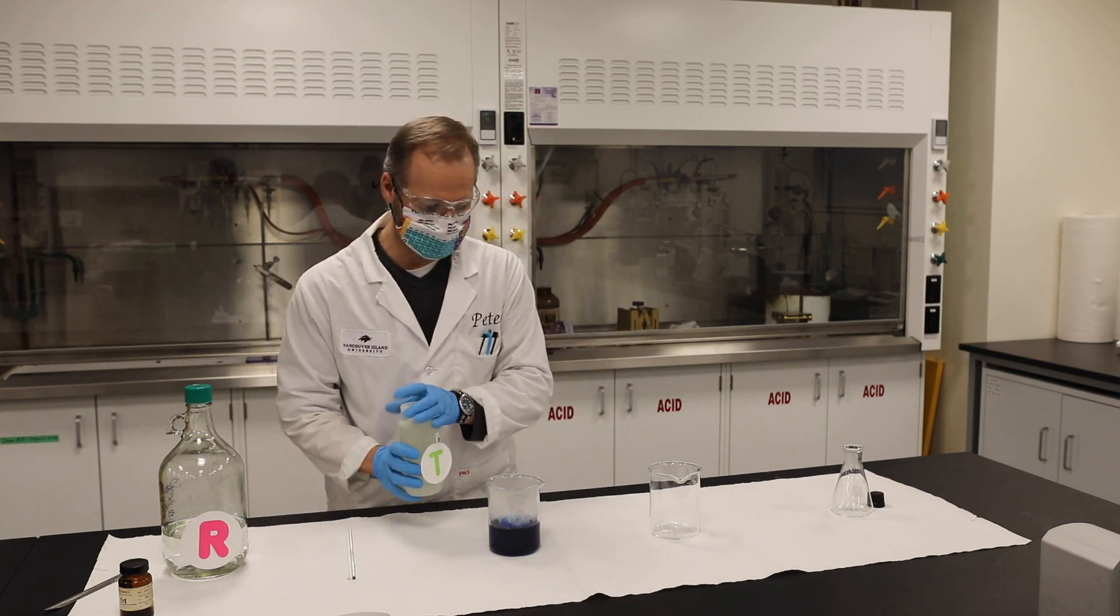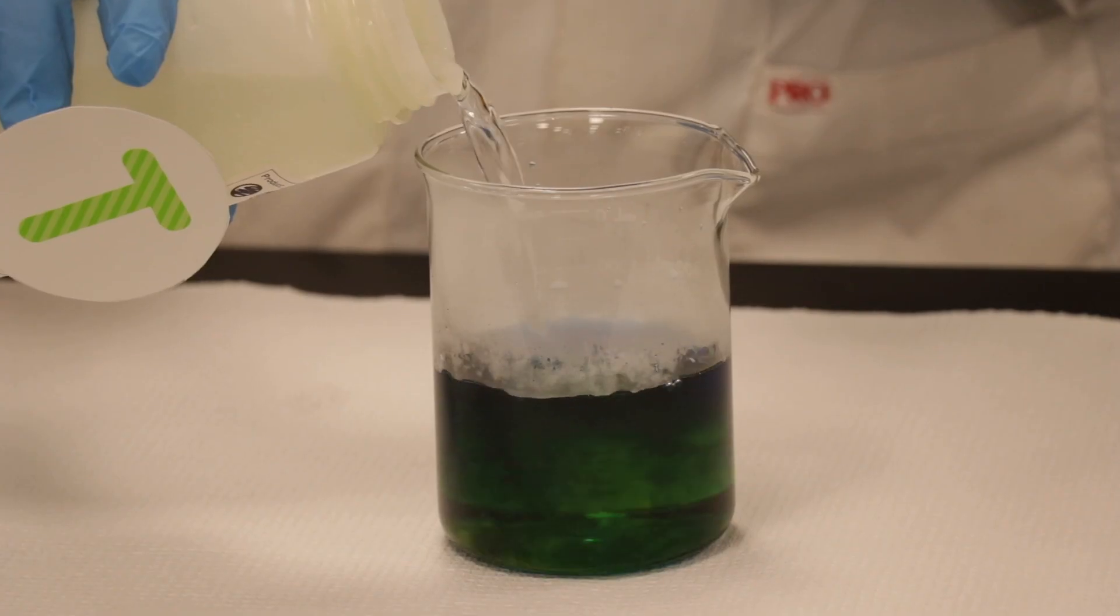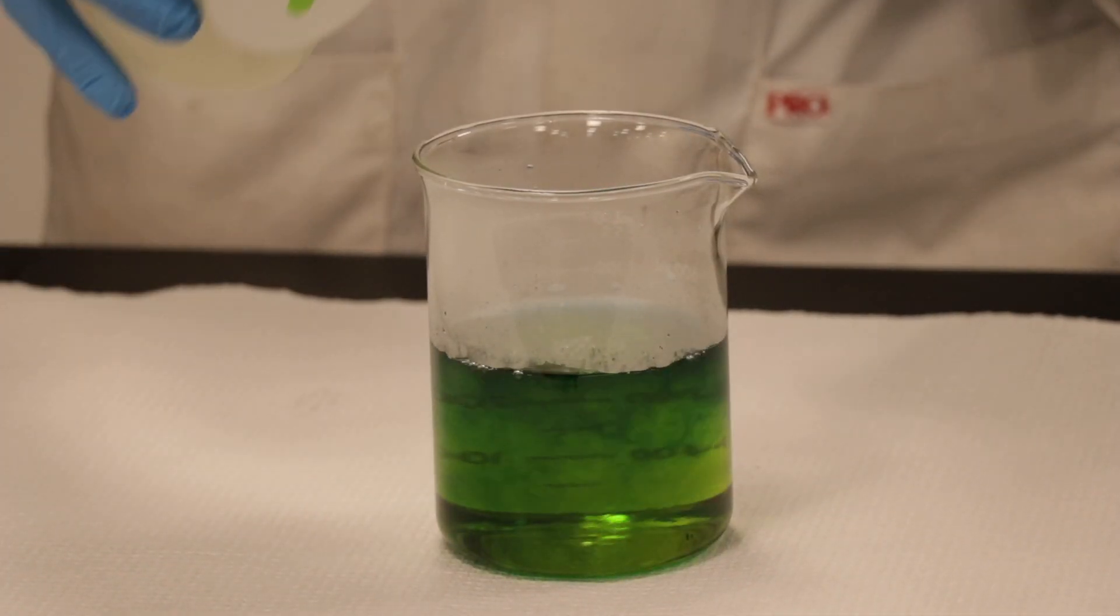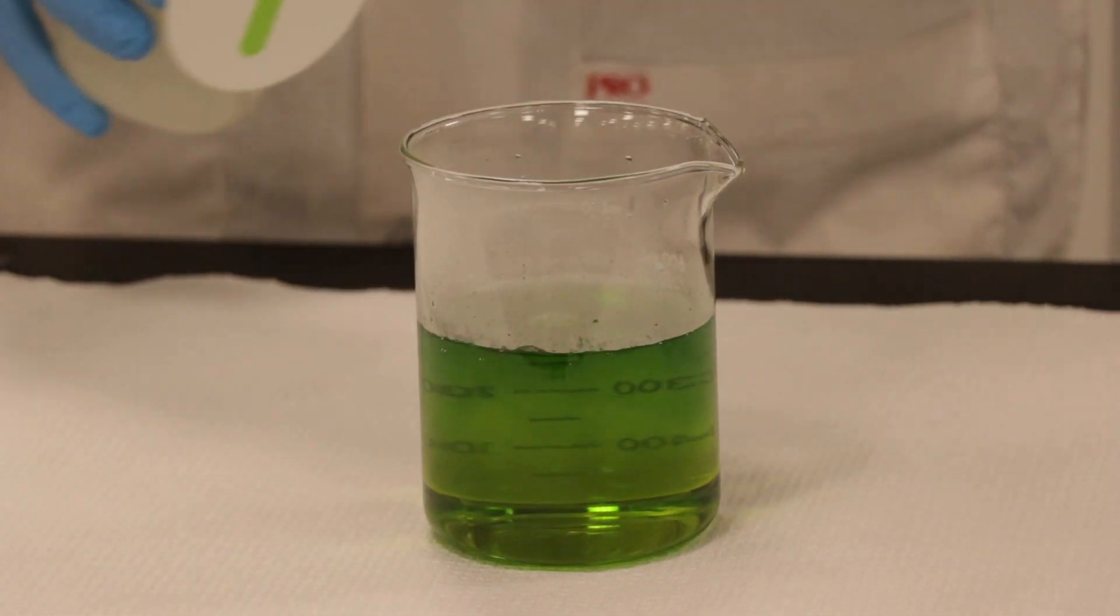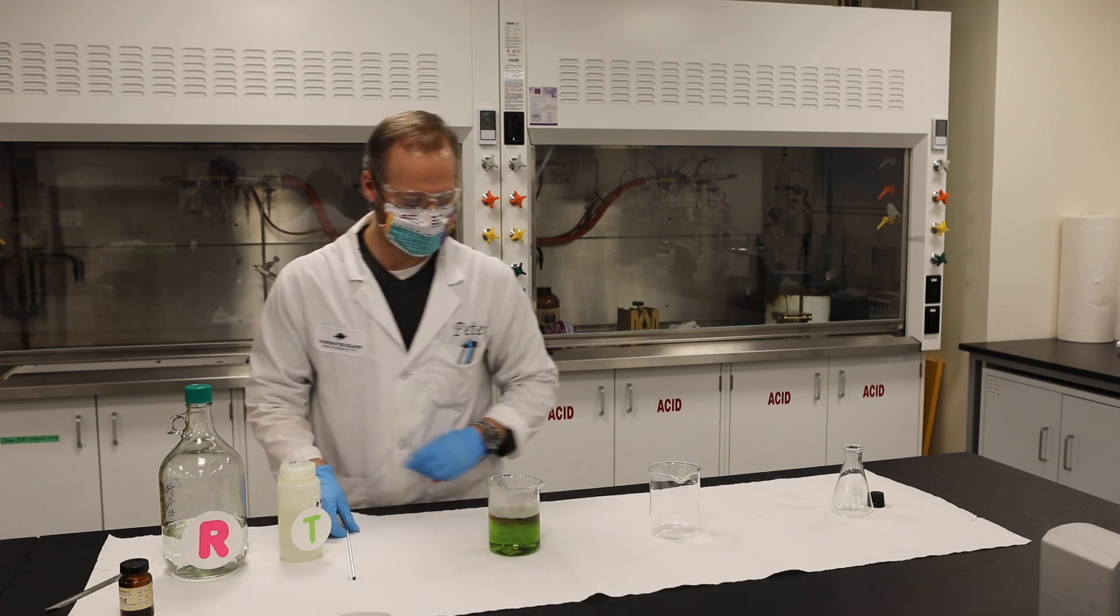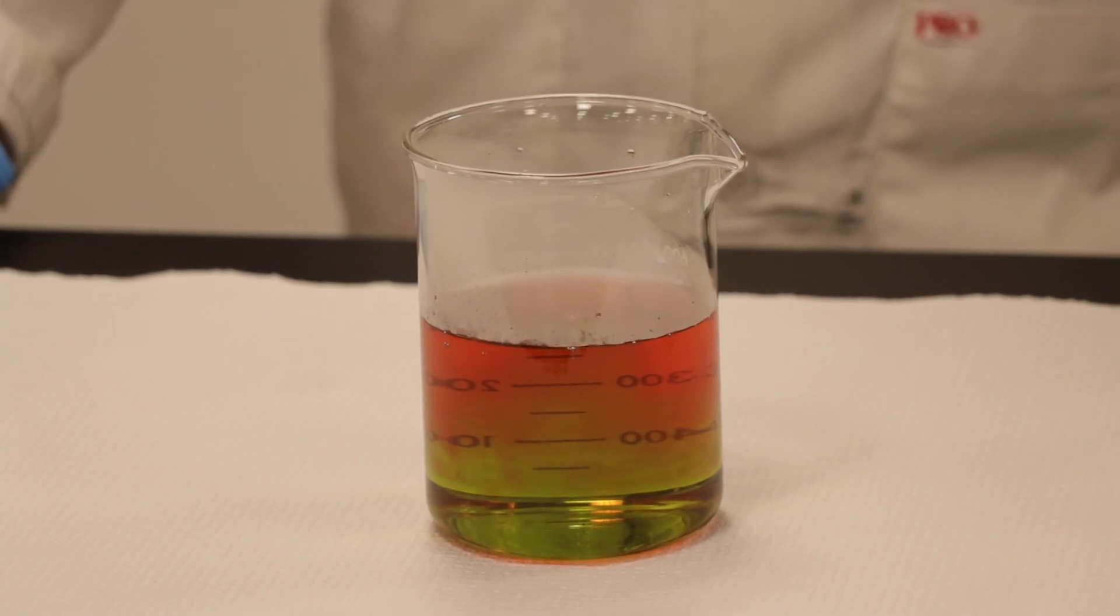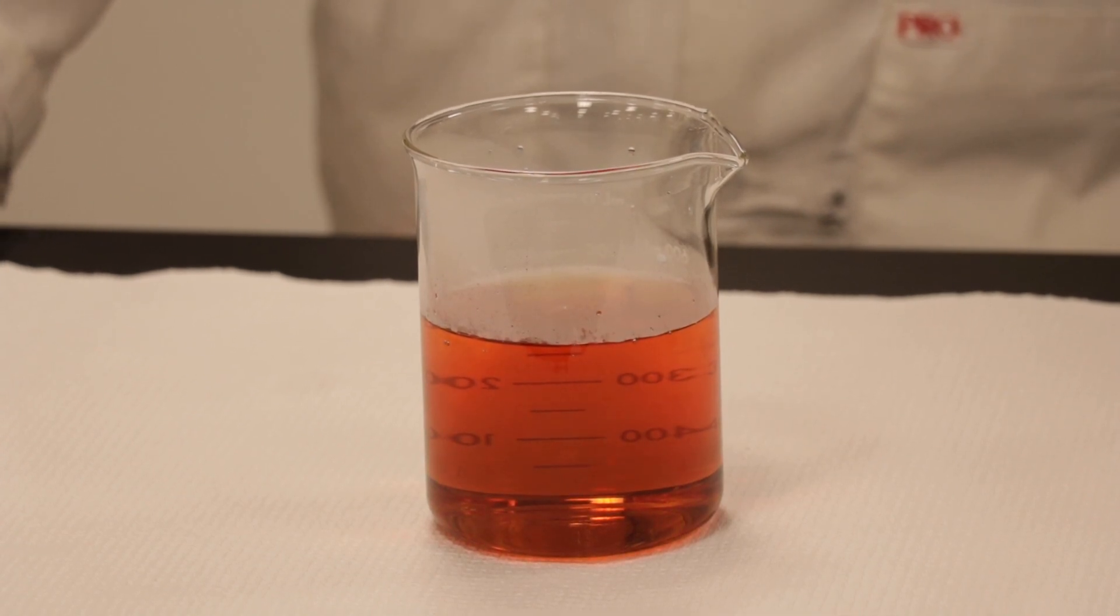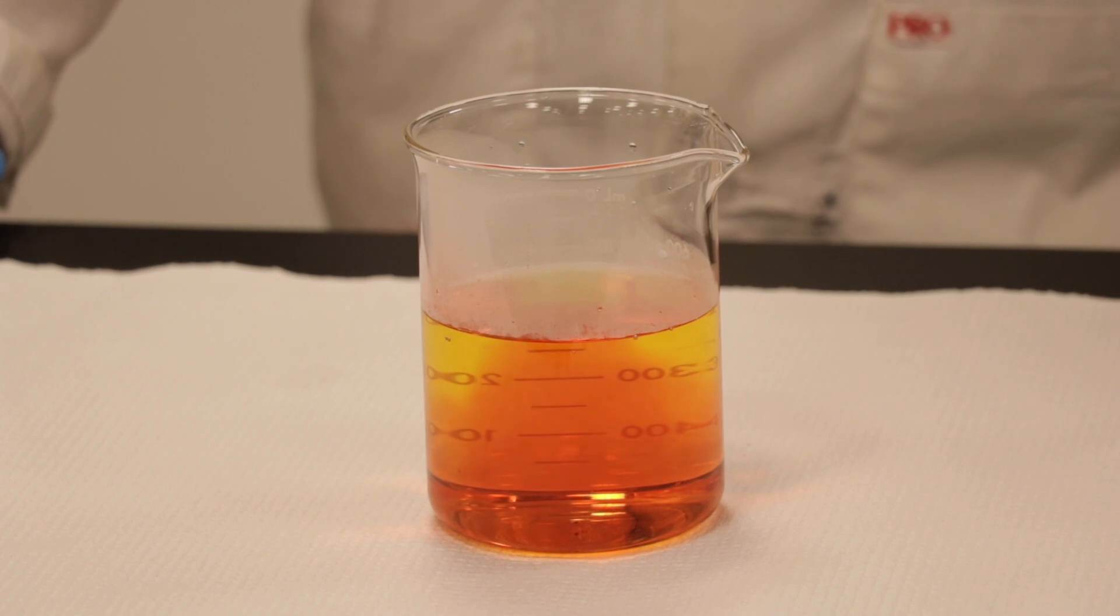Now we're going to add a bit of base, about 80 mils. So now what we've got to do is just wait a minute for it to cycle through. So you have the green, got the red, and it should go to a nice yellow.